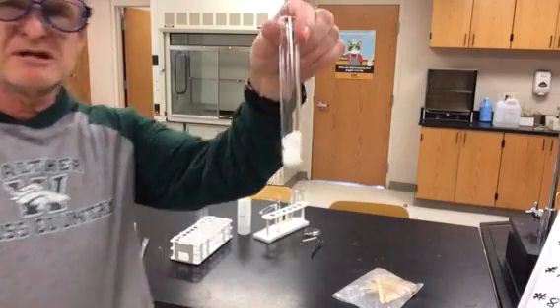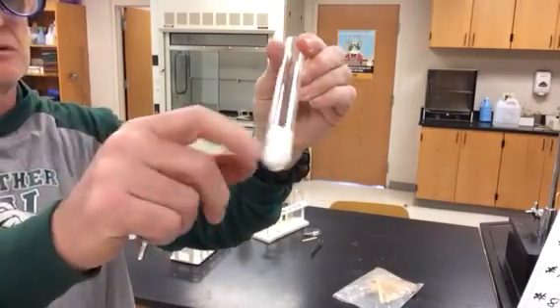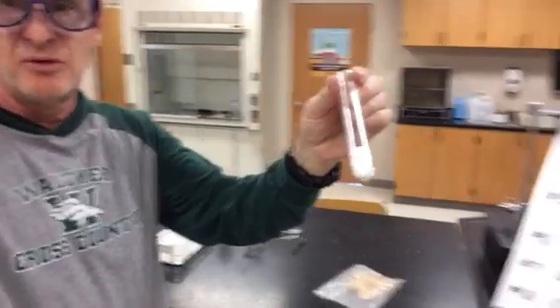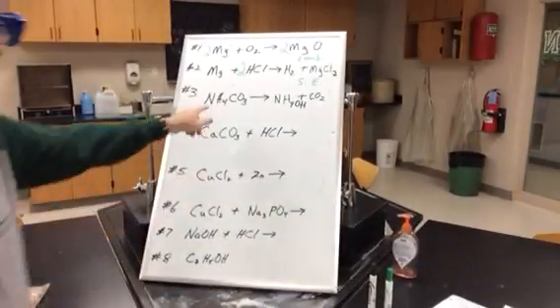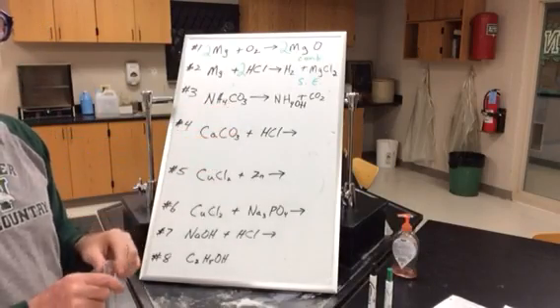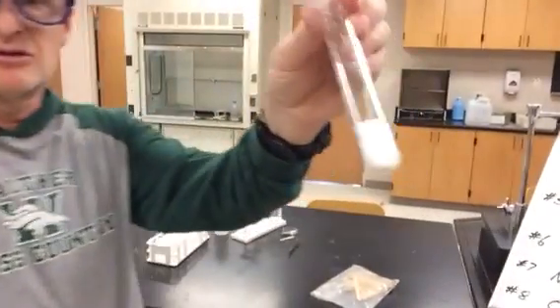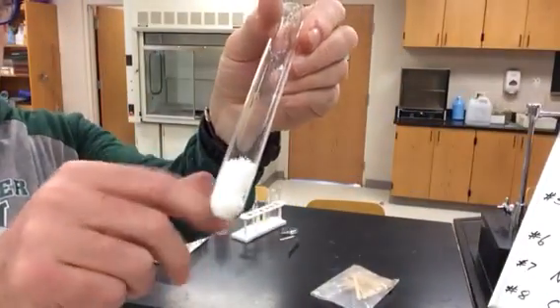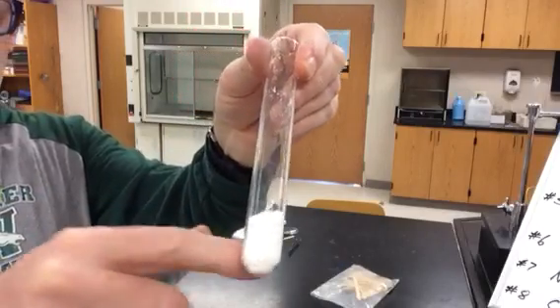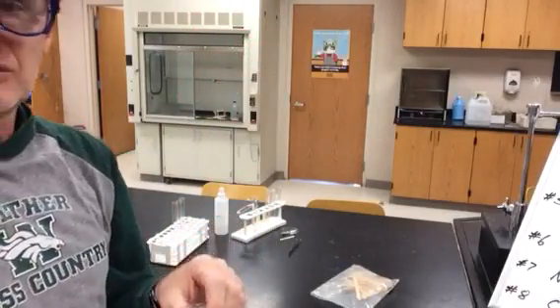Alright, so here's calcium carbonate. Looks like a white powder. Looks very similar to the ammonium carbonate before, right? So you look back, we had ammonium carbonate, calcium carbonate, both carbonates, similar kind of substances. They look pretty similar.